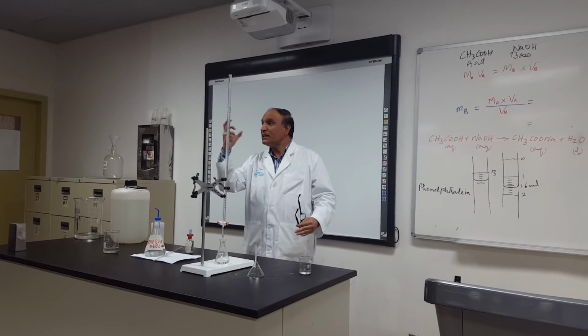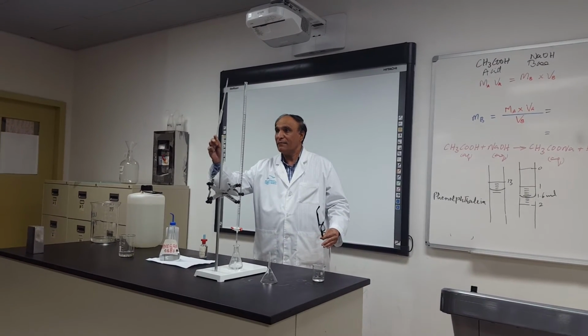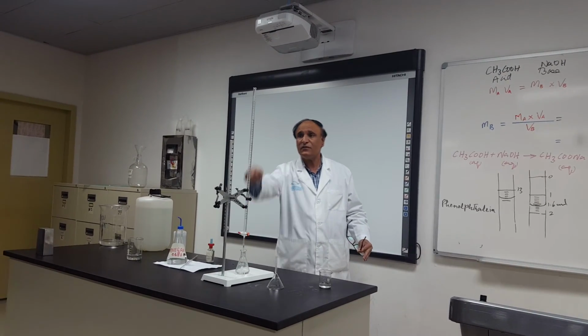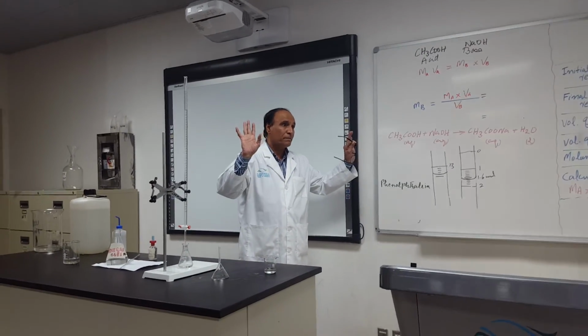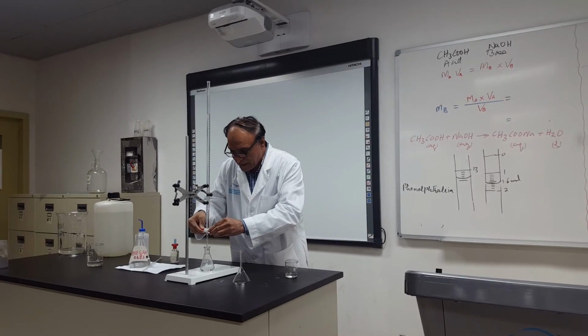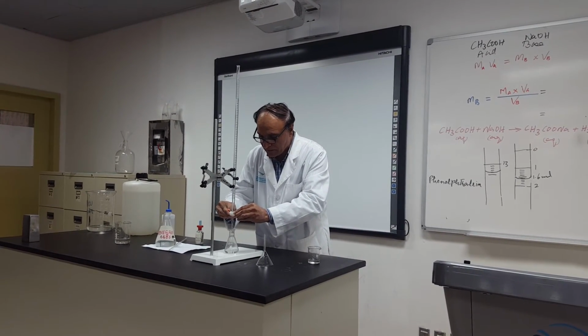Because what is the total amount? How much is the total amount? 10 milli of the acid. It is there. And it is the acid which is going to react with the base. So if you put water, there is no problem. Did you understand? Yes. Now, I start my experiment, and I should be careful that I should add drop wise.